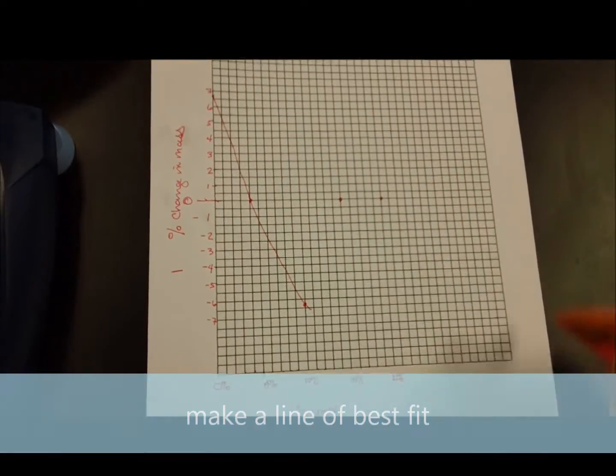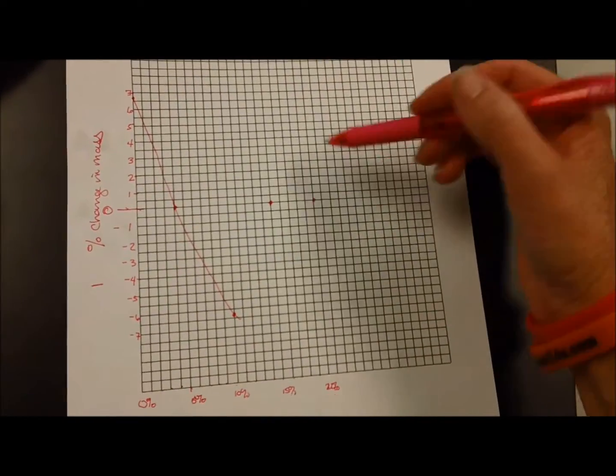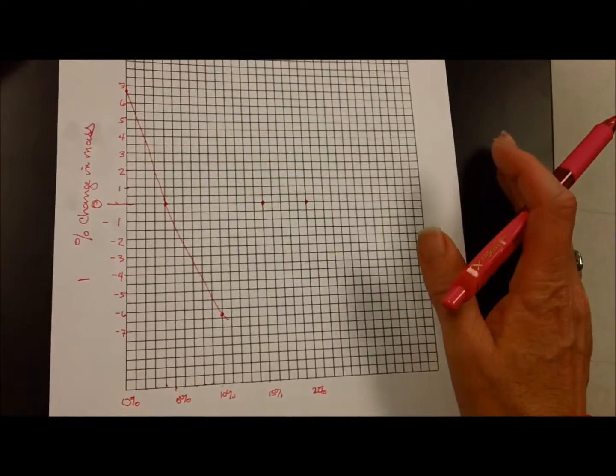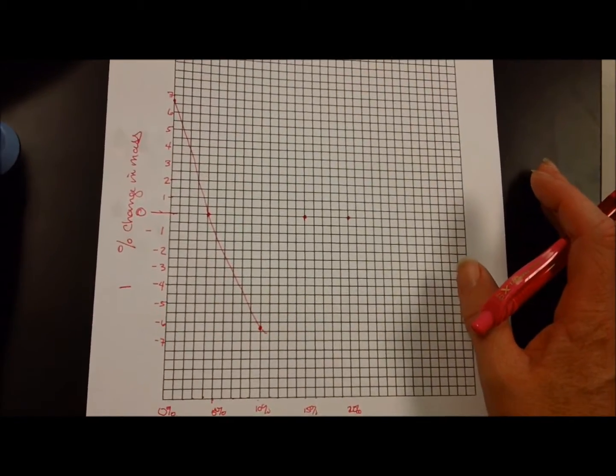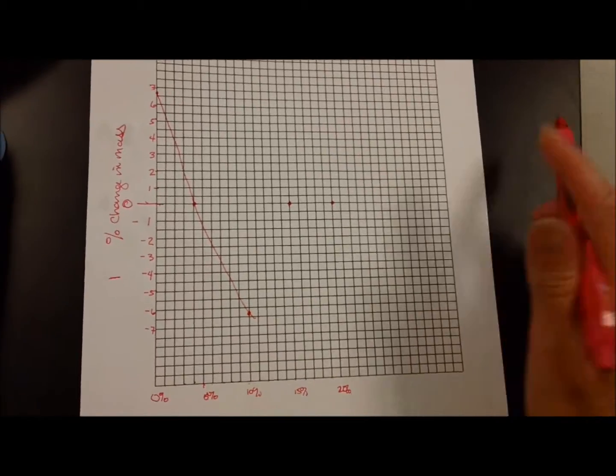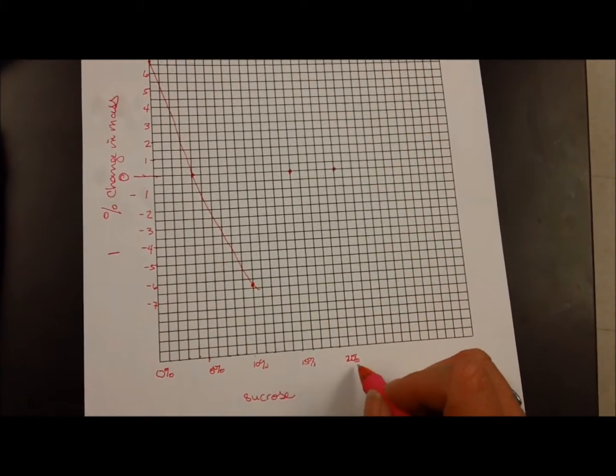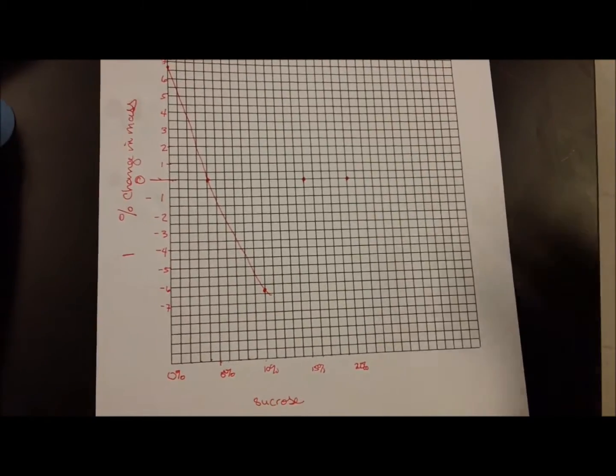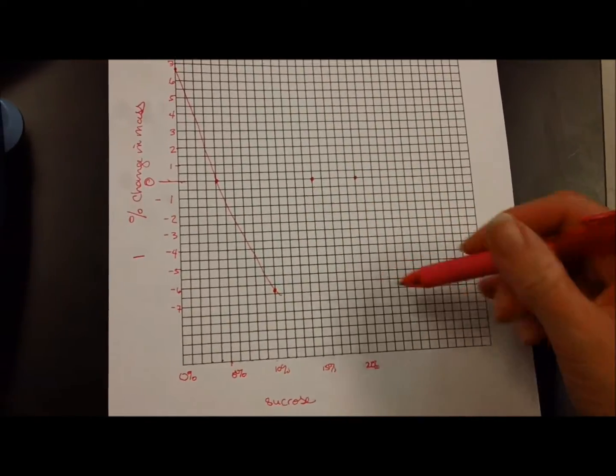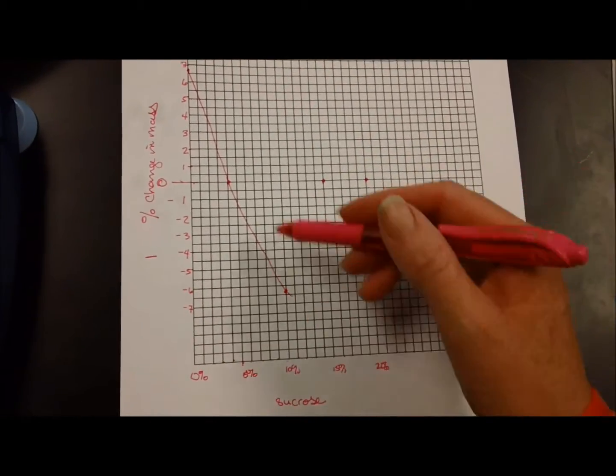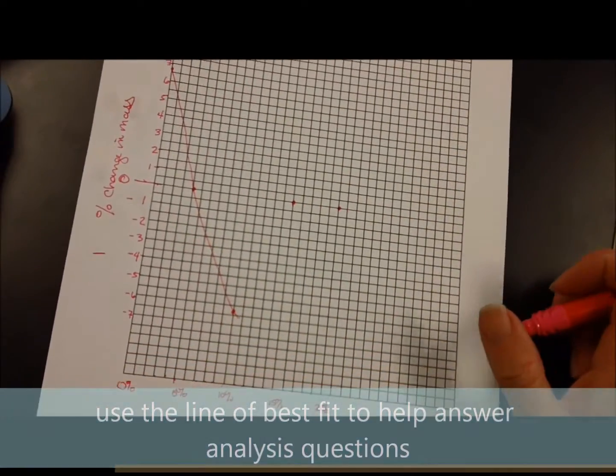After my 10%, we see it has a downward trend, but then it goes back up to zero. This is likely an error in the lab setup. Maybe I didn't put enough solution on top of the potatoes, or something else happened. But we know that a high percentage of solute means that water should osmose out of the cell, and so we would have expected our trend to continue downward. So we'll just leave this as it is. That's our line of best fit, and we'll use this to answer our analysis questions.